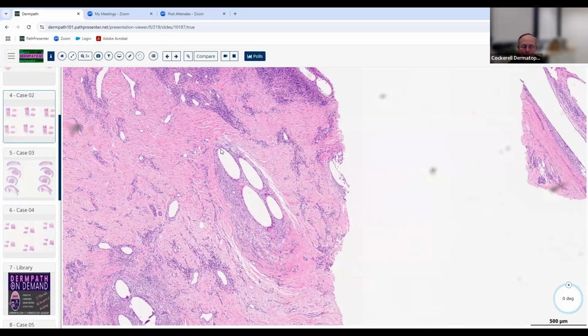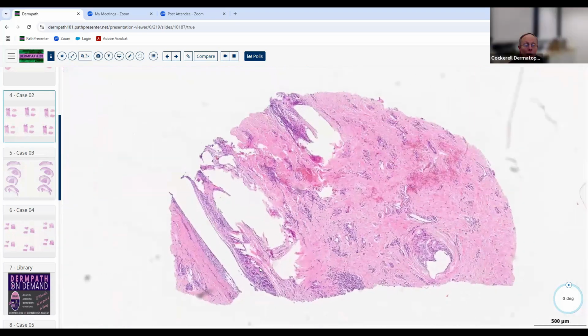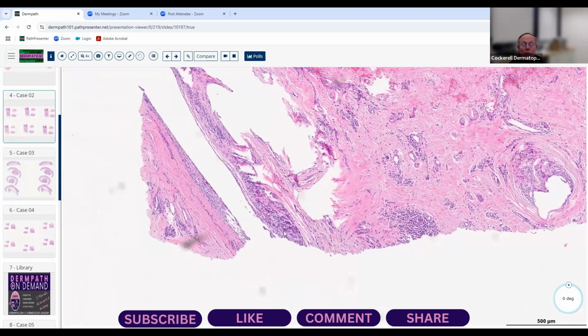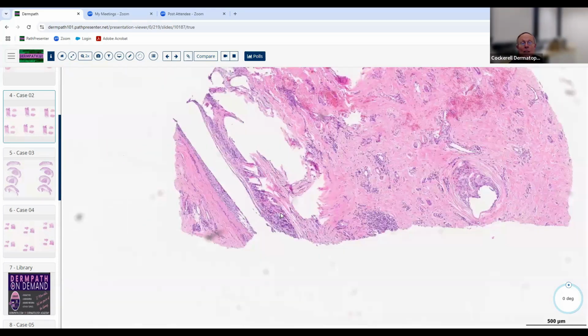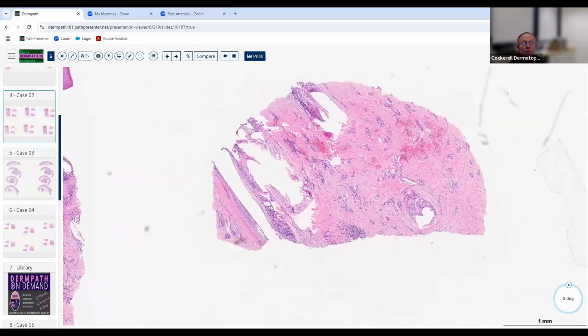Now they're surrounded by fibrosis. There's granulomatous inflammation, which is a secondary finding in this process. So it's secondary. So when you get this targeting of these follicles and they rupture and then you get this secondary change, that's not the primary inflammatory process. If you look over at this hair follicle, we see the primary process here. These are lymphocytes attacking the outer portion of this follicle. There's still a little residual epithelium here. So it's targeting the follicle. Here's another one right up in this area here. So that's the cross section.